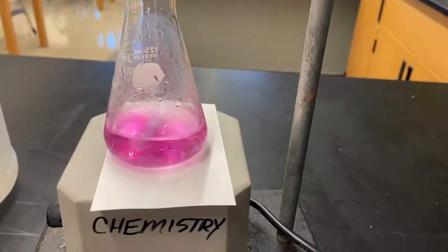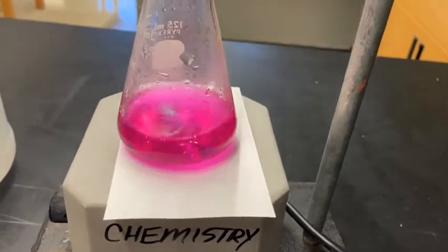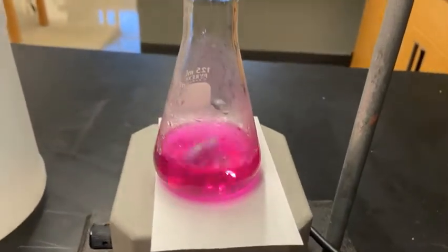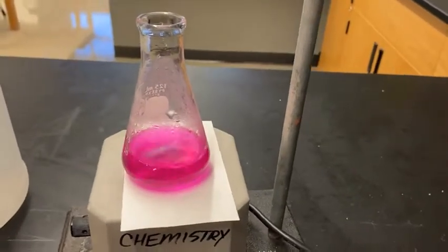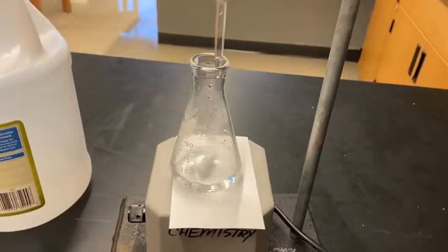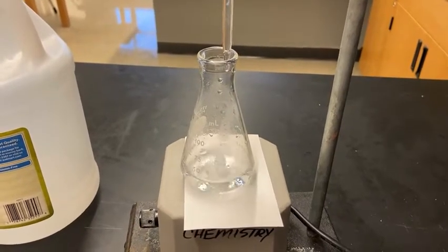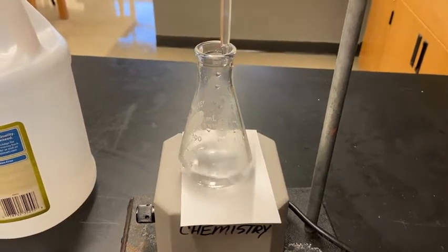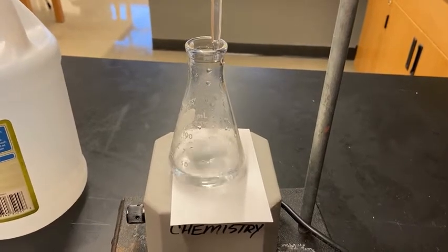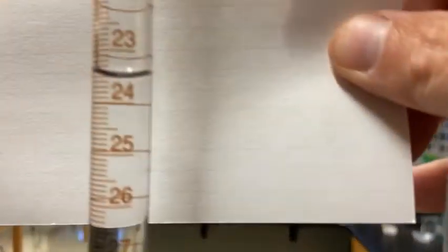Before setting up Trial 3, I want to show you: if I add more base, watch how pink this gets. You can see that if you go past the equivalence point into the base range, it becomes very deeply pink with the phenolphthalein. Alright, I'll need to refill the burette because there isn't enough volume left for another trial. One thing I didn't mention: the volumetric pipette is accurate to two decimal places, so each trial uses 10.00 milliliters of vinegar — make sure you record that with two zeros.